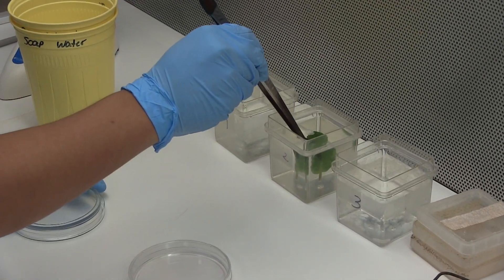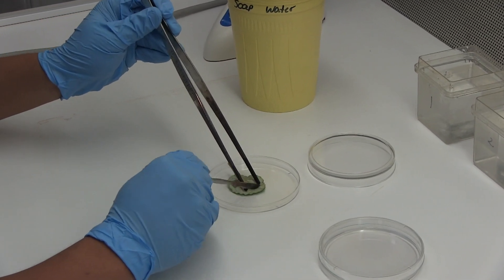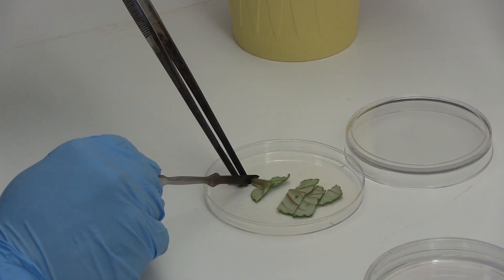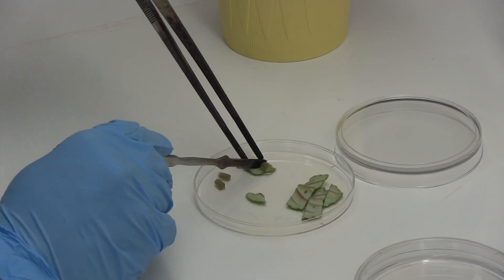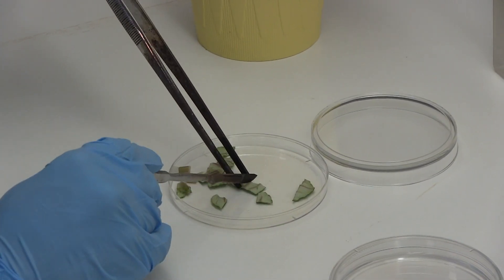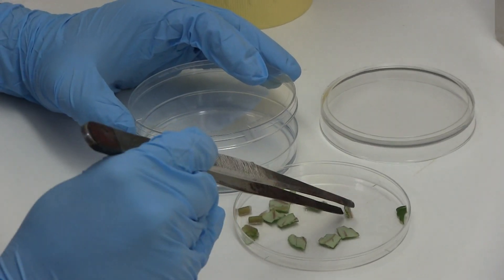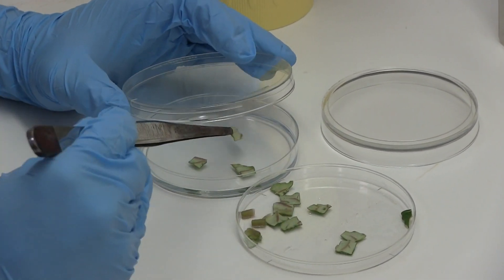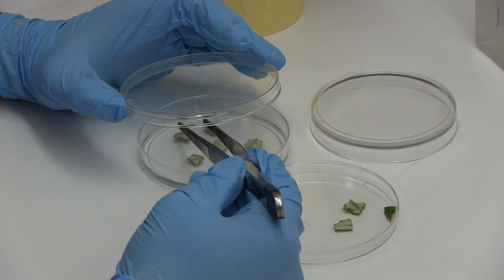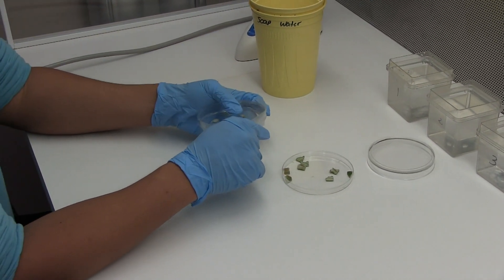Move explants through three rinses of distilled water. Place explants in a petri plate and cut into one centimeter pieces. Use forceps to place cuttings into the growing media petri dish. Wrap the petri plate with parafilm to seal the container.